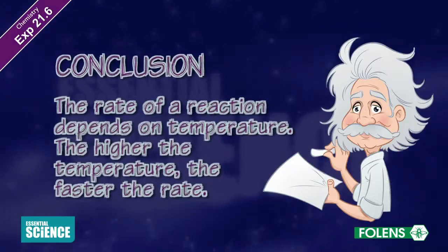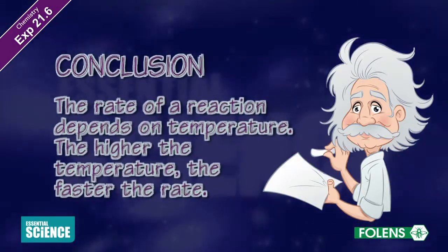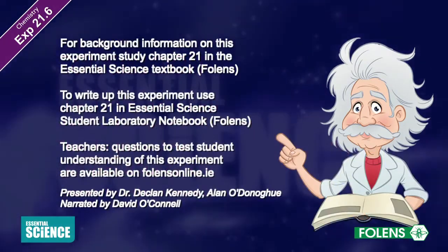We conclude that the rate of reaction depends on temperature. The higher the temperature, the faster the rate. This concludes the experiment.